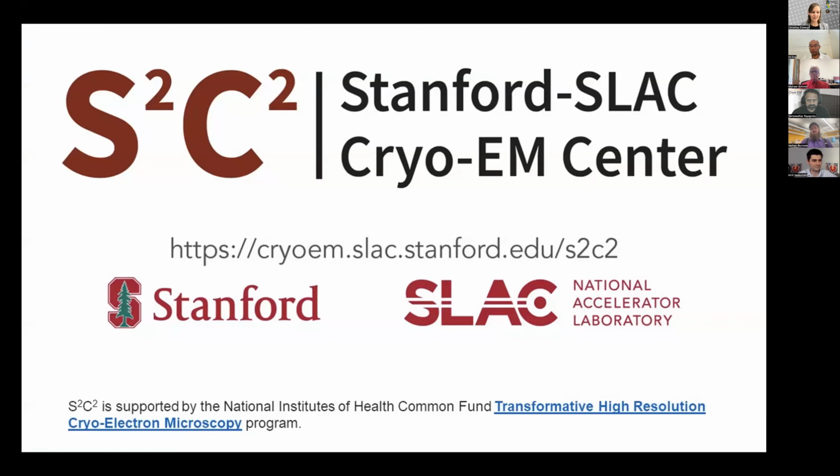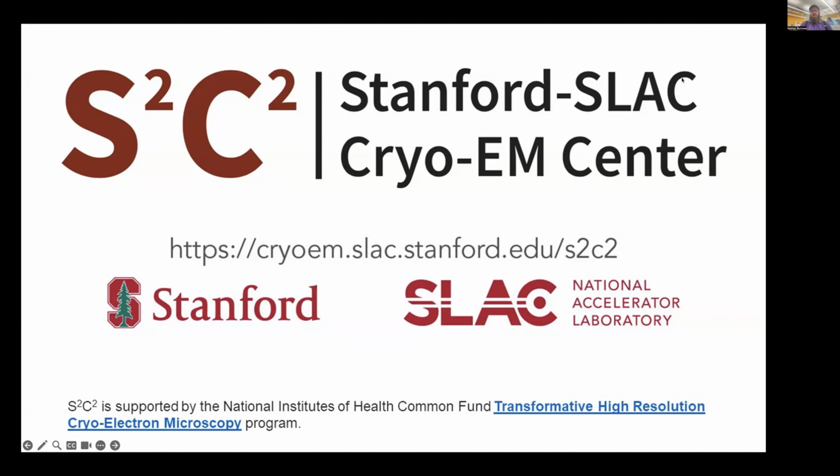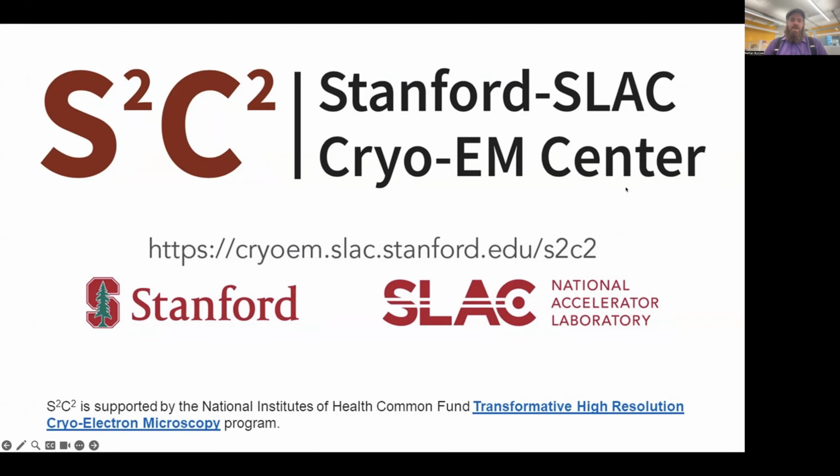Hi, so I'm Nathan Burrows. I'm the screening program manager at S2C2, and we have lots of exciting things going on at our center. The latest is that we just got our VitroJet installed and commissioned, and it's working. So we now have a VitroJet for preparing samples in addition to a Chameleon and the standard VitroBots and Leica EM GP2.